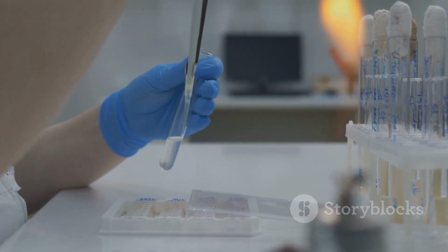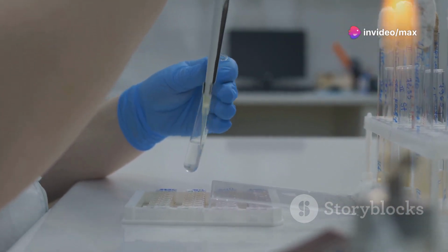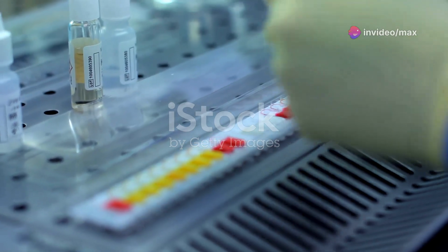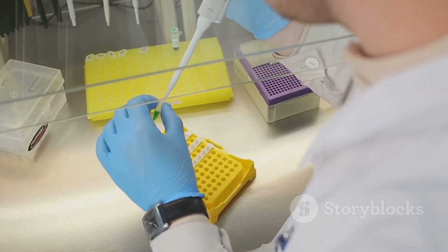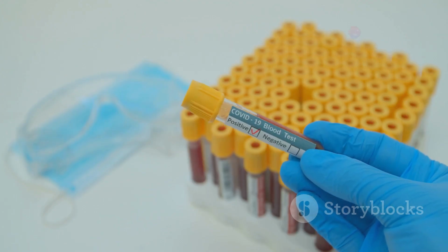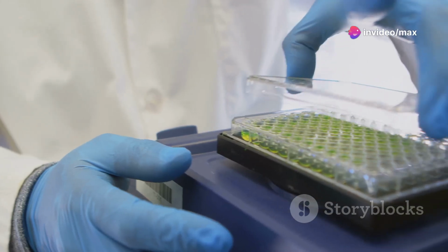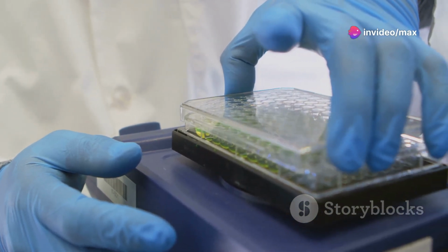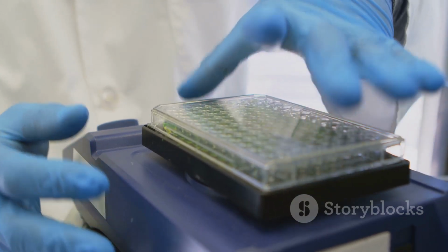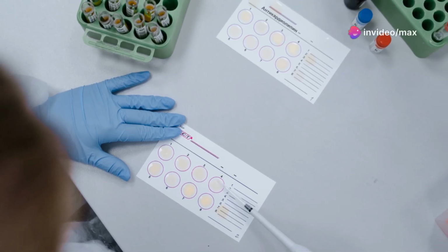The ELISA protocol, much like a well-choreographed dance, involves a series of carefully orchestrated steps. Each step builds upon the previous one, leading us closer to our answer. First, we begin by coating the wells of our ELISA plate with an antibody. This antibody will capture our target molecule from the sample. Next, we introduce a blocking solution. This step is like placing do not disturb signs on any unoccupied surfaces of the well, preventing non-specific binding and ensuring accurate results.